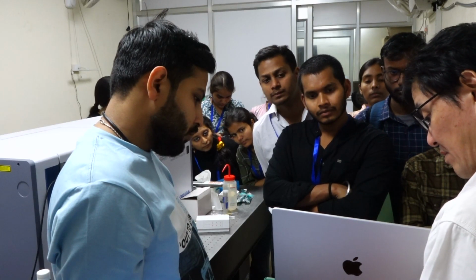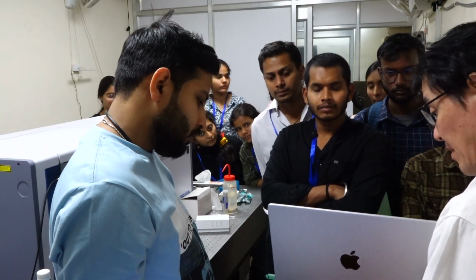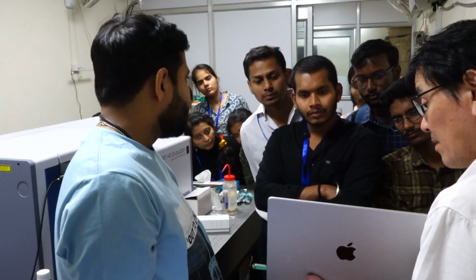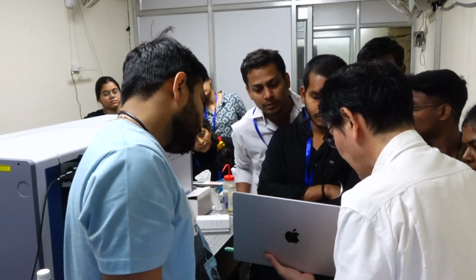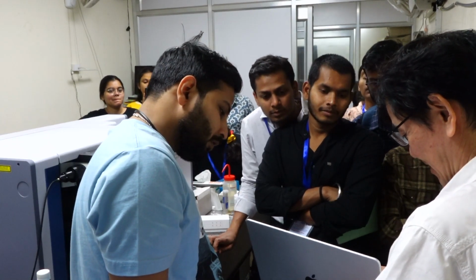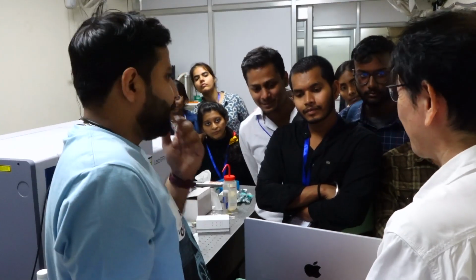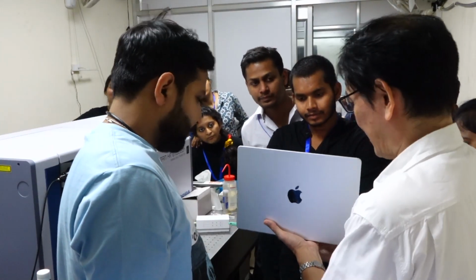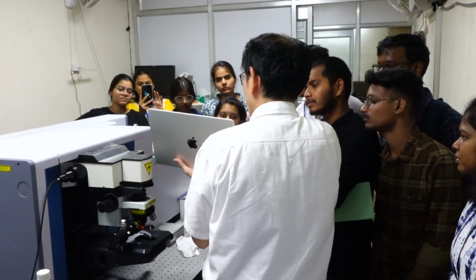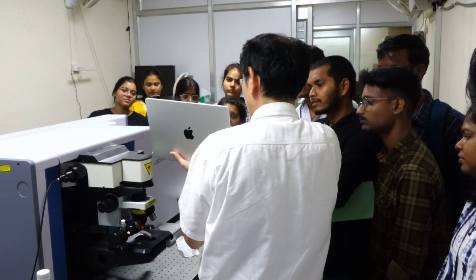Okay, so let's change the range, then we see a clear difference between sucrose and fructose. Yesterday I put this portion of these two peaks, and now it is expanded. There is a clear difference between the sucrose and fructose spectra, so it's easier to distinguish these two similar sugars. Okay.